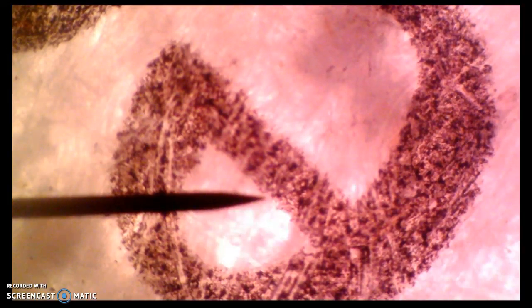All right, I am going to take it over to the 100 power lens. And using the fine adjustment knob, just focus it just a little bit more. Okay? Now go ahead and sketch in that circle what you see.